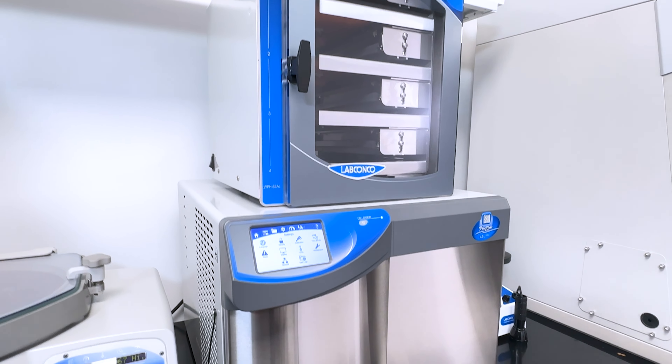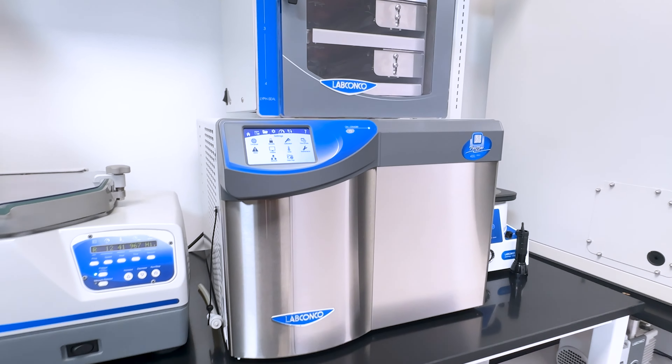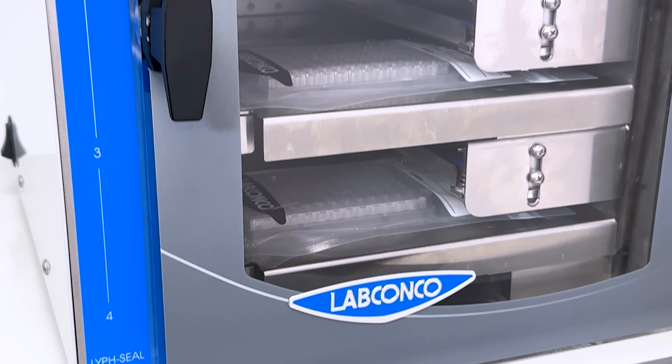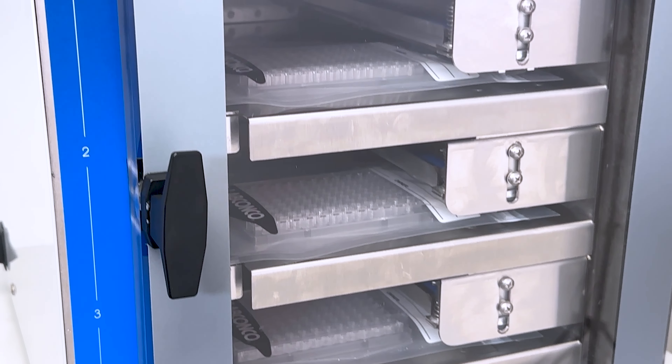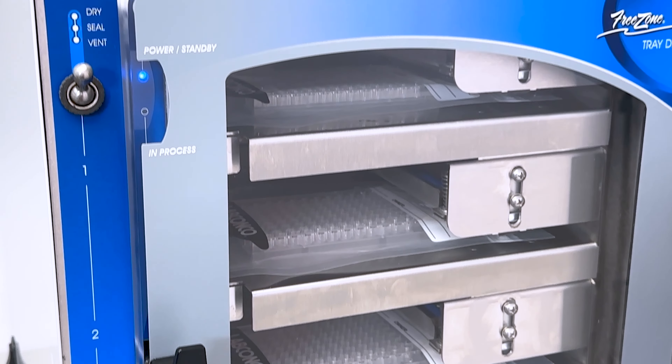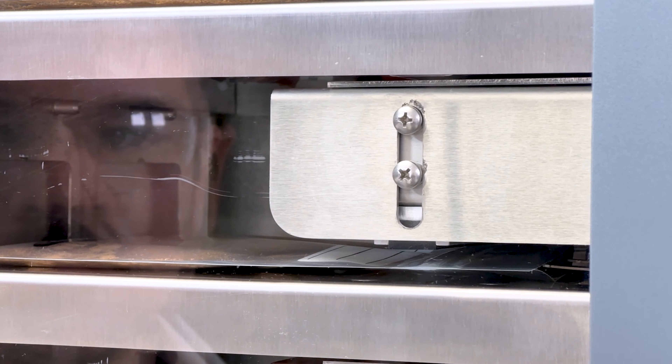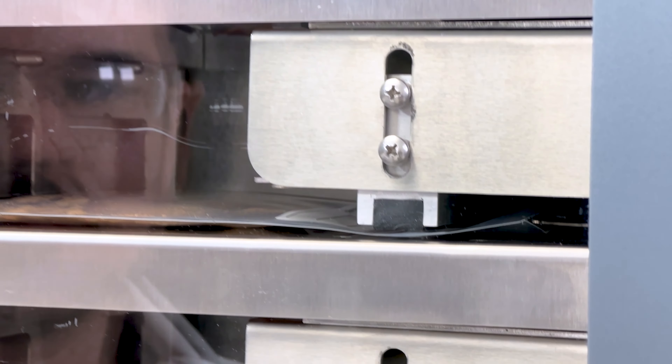Unlock the future of sample prep with the newest member of LabConco's FreeZone product lineup, the LifeSeal TrayDryer. This innovative new accessory revolutionizes the freeze drying process, providing an all-in-one solution for lyophilizing and sealing a wide variety of sample sizes under vacuum.